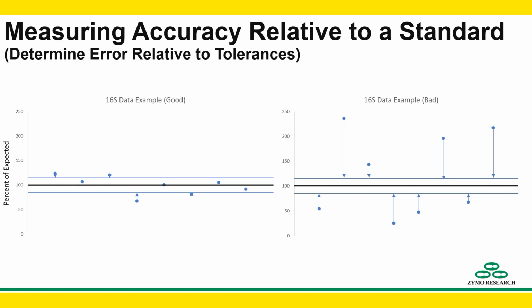All we do following that is we measure residuals, or errors, or deviation from the expected. These are all different ways of saying we're measuring error. Only in this case, rather than measuring error relative to 100% of expected or a theoretical perfect, we're actually taking into account the reality that there is a manufacturing tolerance, and we're measuring to the range of our manufacturing tolerance. Or in other words, we're saying how much error is there that cannot be accounted for by the inherent inaccuracy generated by manufacturing.